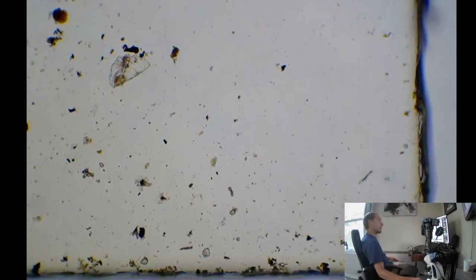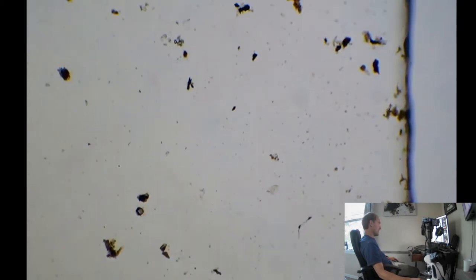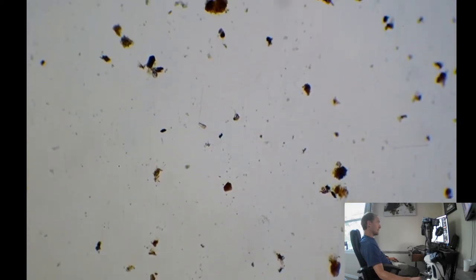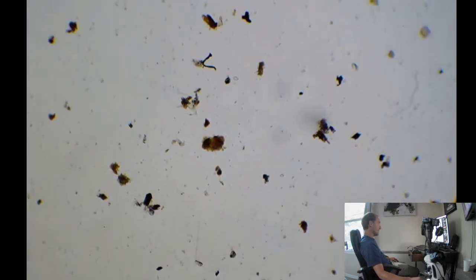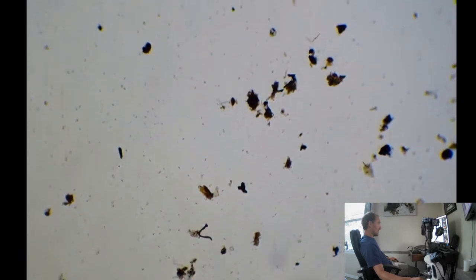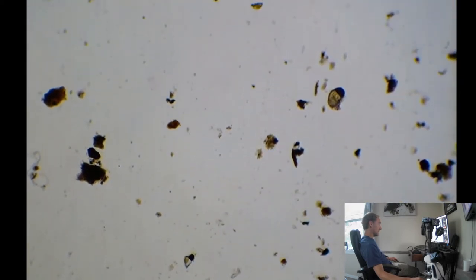Let's check out my dad's soil. We're out at 100x right now. Let's see what we see. We're just going to do a scan here, up and down, and see if we can find anything interesting. So far, it's looking pretty good. Not seeing any clear bits that you would normally see on a tilled or compacted soil.